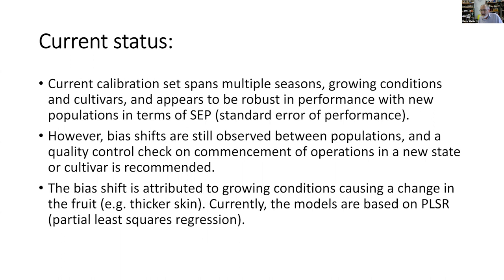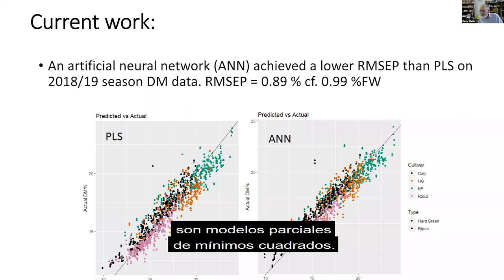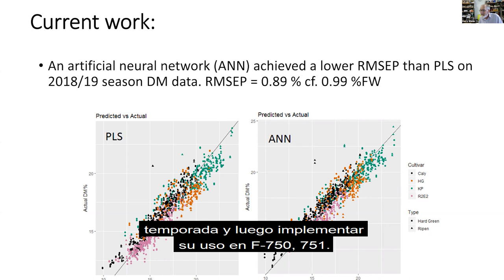And last slide is just to say where we're up to next. The models currently implemented are partial least squares models. We've been playing around with artificial neural networks and we're getting a slightly better result with that. So that is something we would confirm in this coming season and then implement into use in the F750, 751.